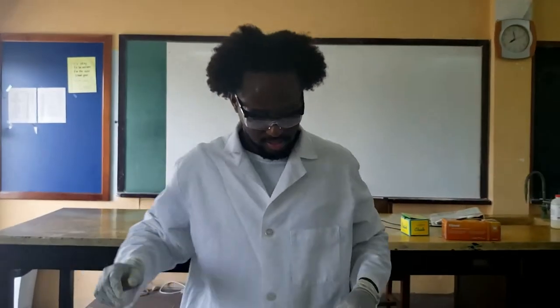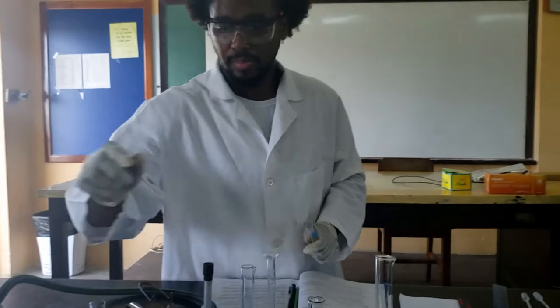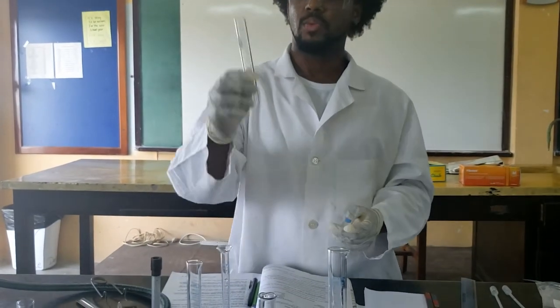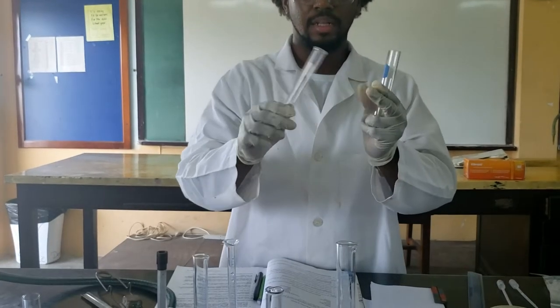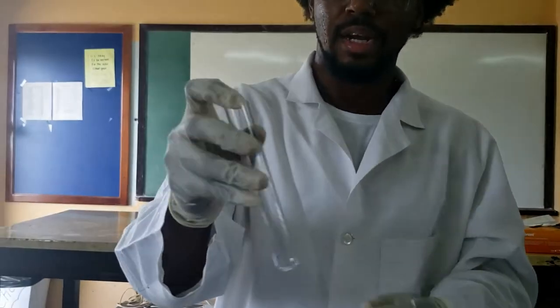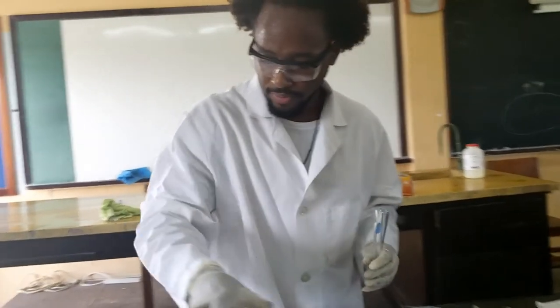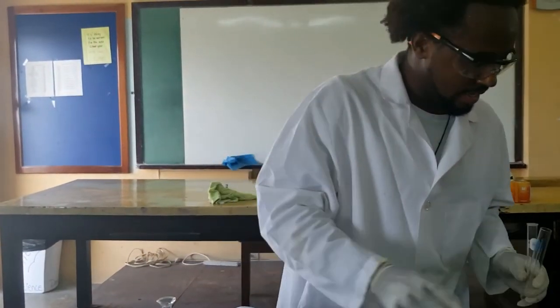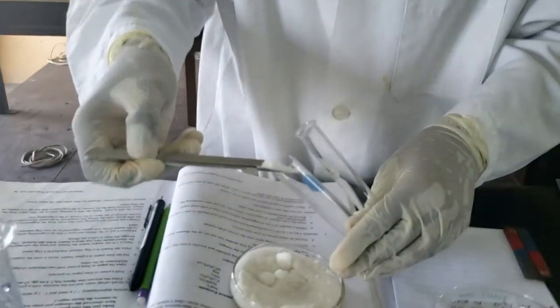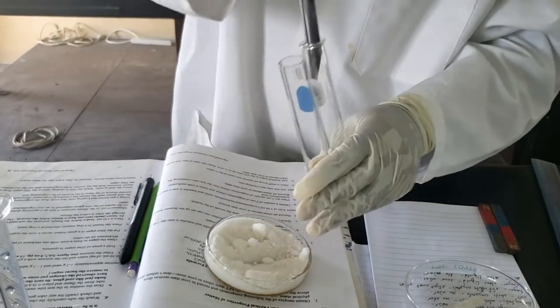Experiment two completed. The next experiment we are going to need one boiling tube and one test tube. Students often confuse the difference — what we refer to as a test tube is the normal thin glass tube with a rim, while the boiling tube is the thicker hard glass that is rimless. So what we are going to do is take some sugar and add a scoop to each tube — some sugar goes in the boiling tube, and some sugar goes into the test tube.